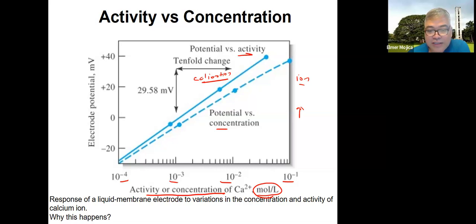So the way that they look at this, the one that is affected here is due to what we call increasing electrolyte concentration. So when the electrolyte concentrations are not too great, it is often helpful to swamp both the sample and the calibration standard with an excess of the inert electrolyte.